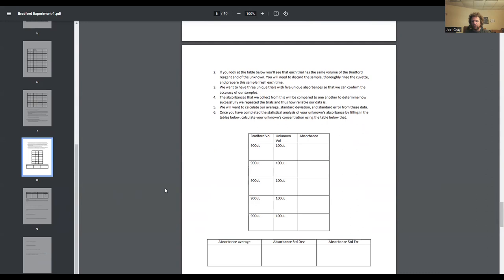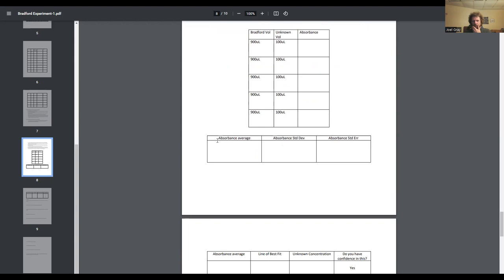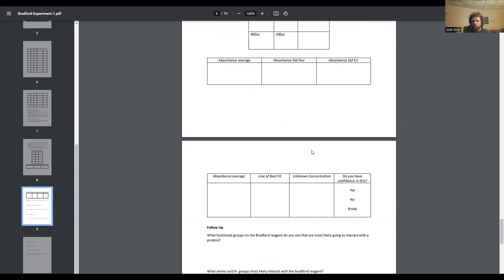Bradford and unknown protein volume, 900 and 100. Determine the absorbance of that. Do it a total of 5 times because you want this number to be very reliable. You want to be able to trust that amount. Then whenever you work with that, you can calculate your absorbance. You can ultimately come up with a concentration of that unknown protein sample.